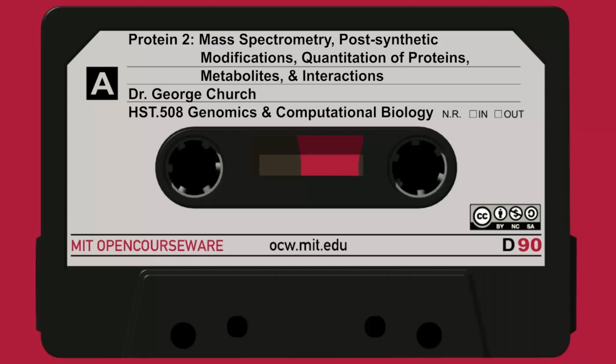The sort of thing that we expect from purification is to reduce some source of noise. That is to say, in the process of identification or quantitation of proteins or their components, we want to remove sources of noise. The major source of noise would be environmental contamination, or more often contamination with other bona fide members of a mixture, other proteins that may be very abundant, or breakdown products or related products. And we want to separate it into enough different components so that the major ones are off in their own little bin and don't interfere too much.